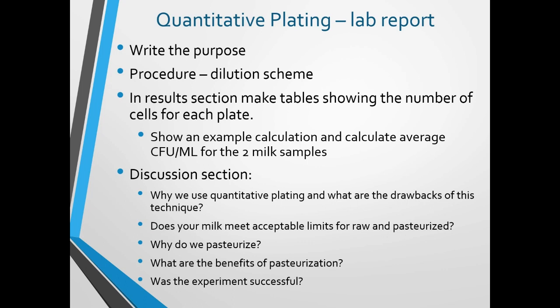And these are the things that you need to address in the discussion section. Why we use quantitative plating and what are the drawbacks of this technique? Does your milk meet acceptable limits for raw and pasteurized milk? Why do we pasteurize? What are the benefits of pasteurization? And based on your results, was this experiment successful?